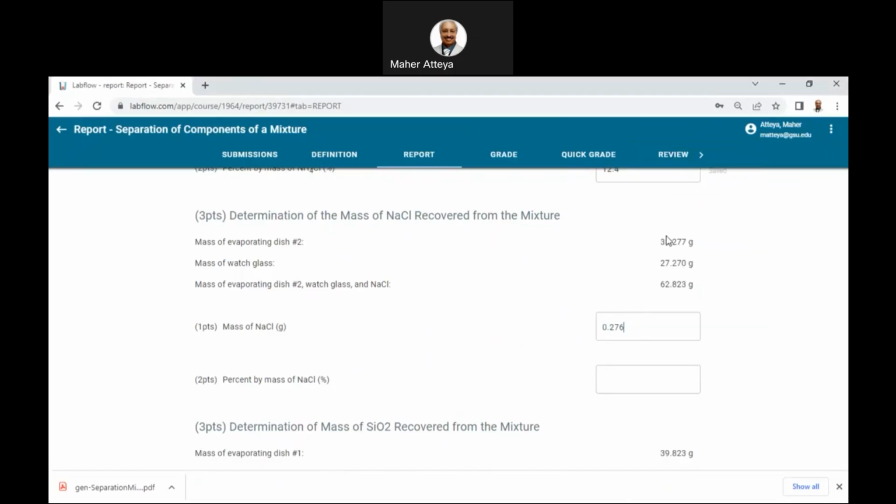So this one pasted is 0.276, and I will paste this one here as well. And this is grams. This is grams, okay?